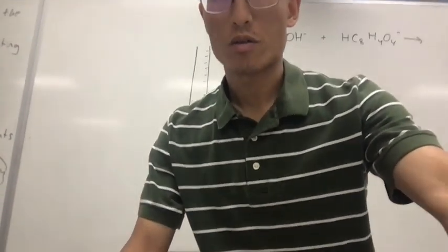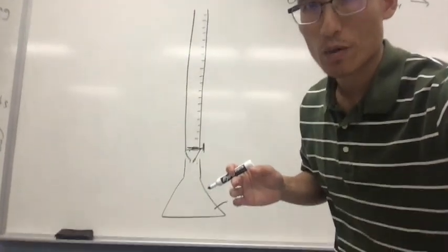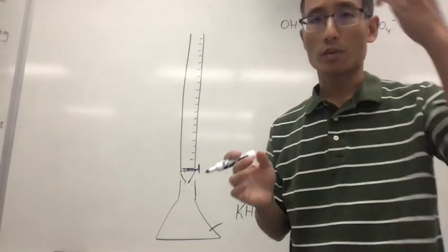Hey everyone. So today I'm just going to give a brief overview of our lab that we're going to do next week. We're going to do something called a titration.